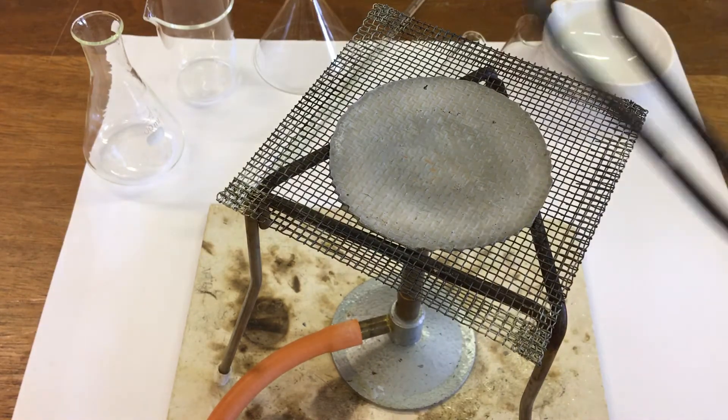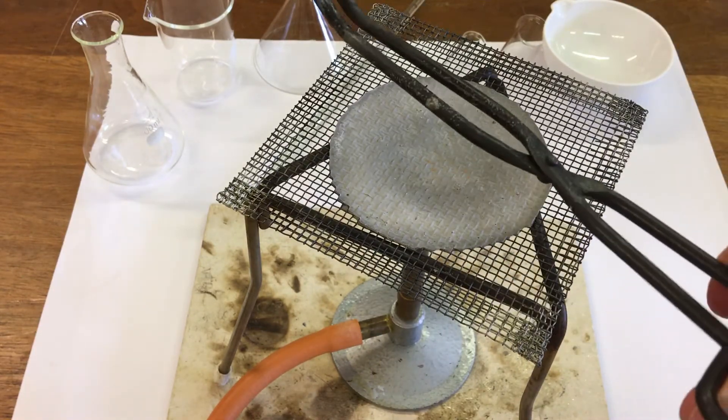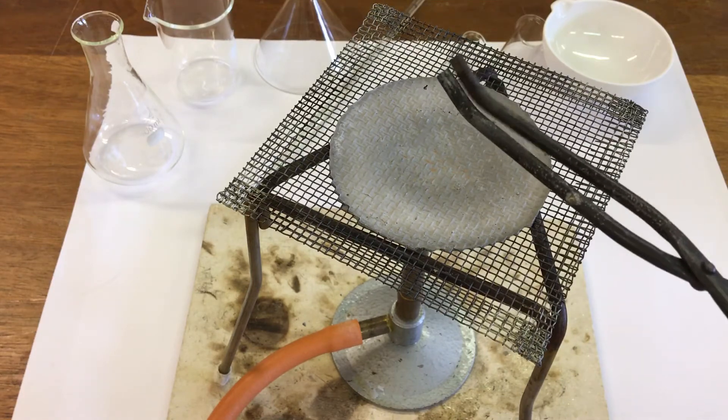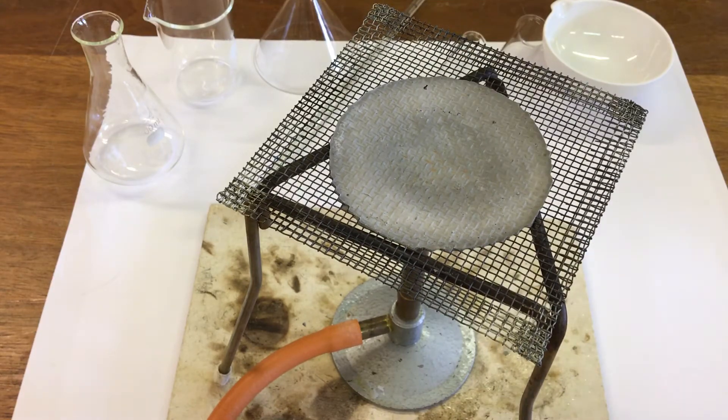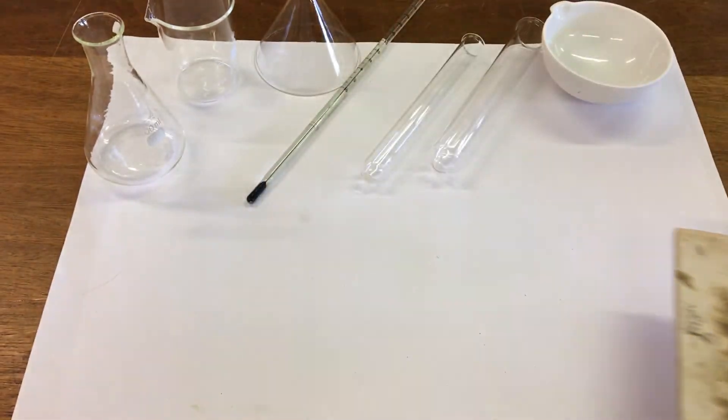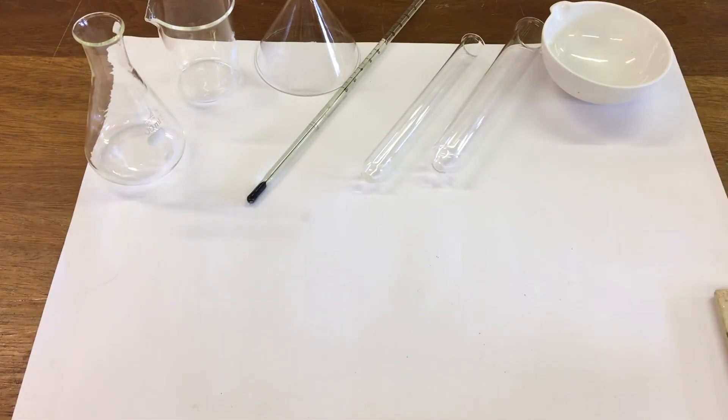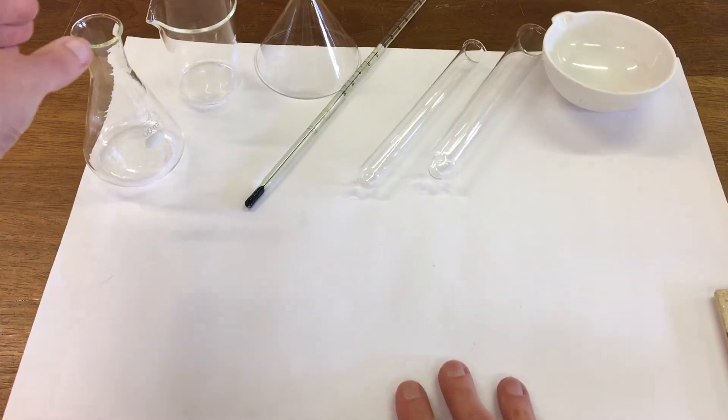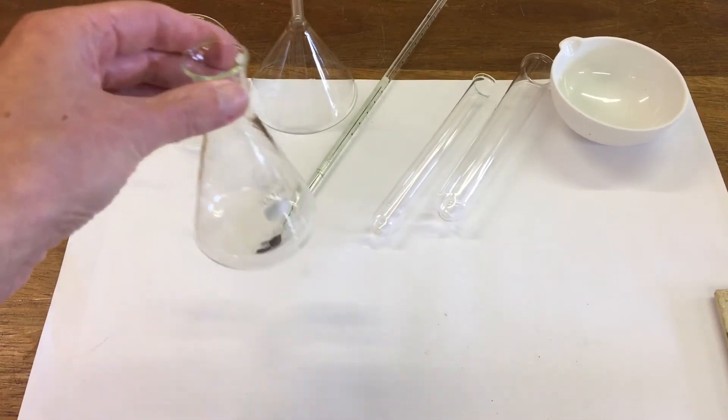Next we have some tongs used for holding hot things. The next item is a conical flask. This is a piece of glassware, so that's a conical flask.